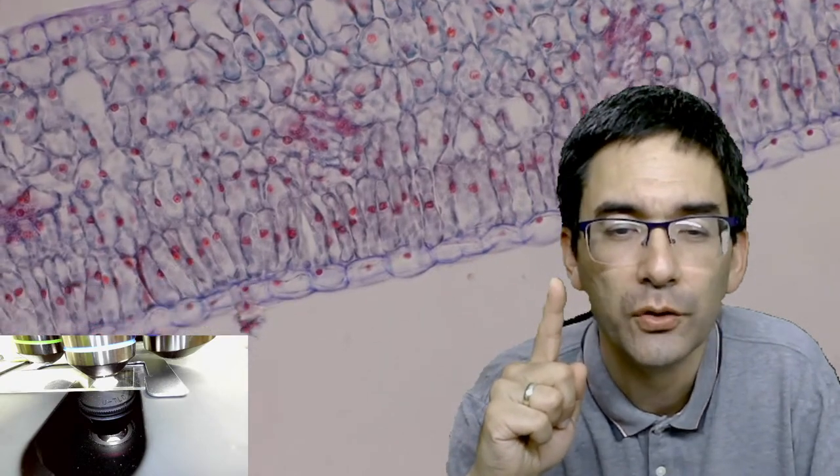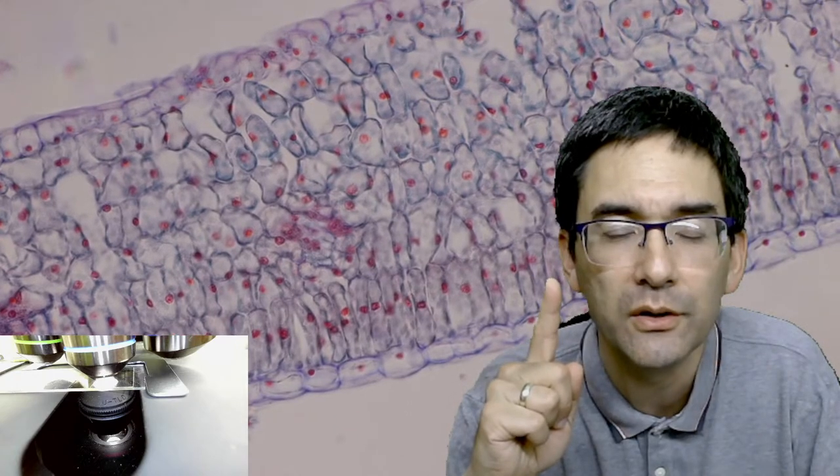You see the vertical layer of cells - the palisade mesophyll - and over here there are lots of loosely packed cells - the spongy mesophyll - with all those big air spaces. Then maybe if we're lucky at 60 times we're able to see some stomata. The bottom layer is now on the very top in the image. Those dark red dots are nuclei - this specimen has been stained.